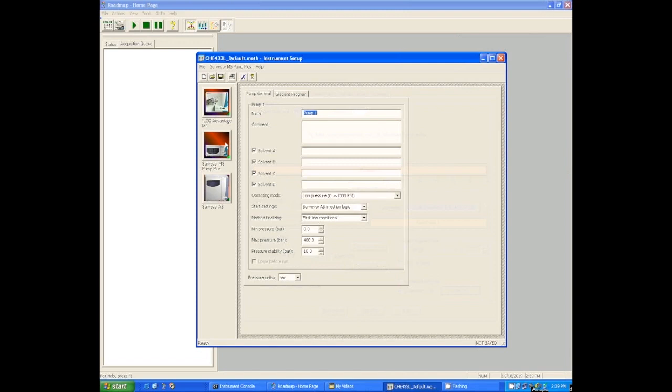So unlike a lot of systems, Excalibur consolidates all the attached instruments into one method file. So here we see that this one method file is going to control the mass spectrometer, the LC, and the autosampler, the Surveyor AS. And you can see those pictures off to the left there.